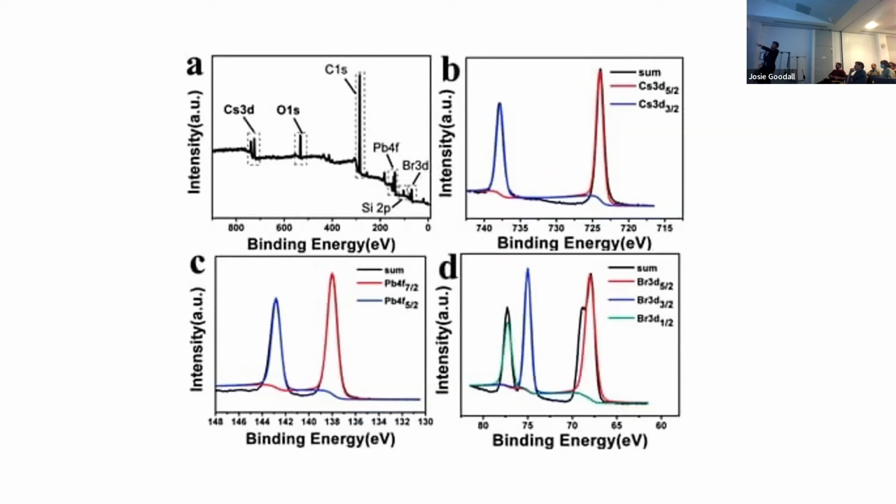So this is actually a cesium peak. This is cesium 4P, I think, something like that. I might be wrong. It's definitely a cesium peak. So what they've done, they've again misidentified a bromine peak. They haven't realized that features from another element may appear in their region, even though it's their bromine 3D.